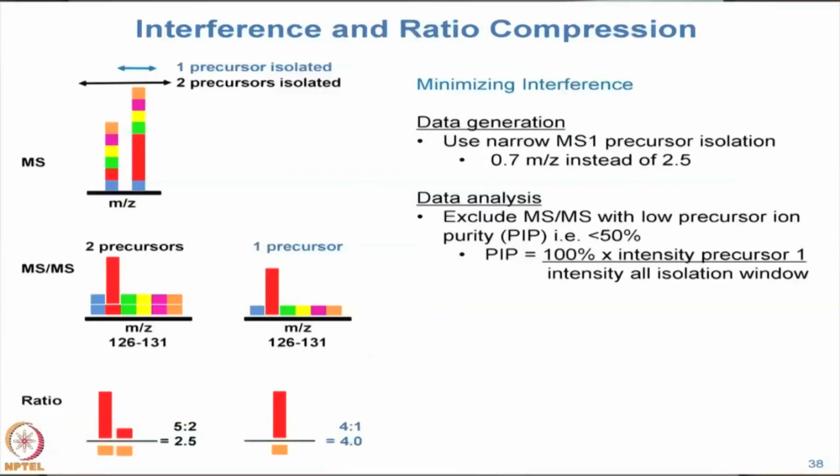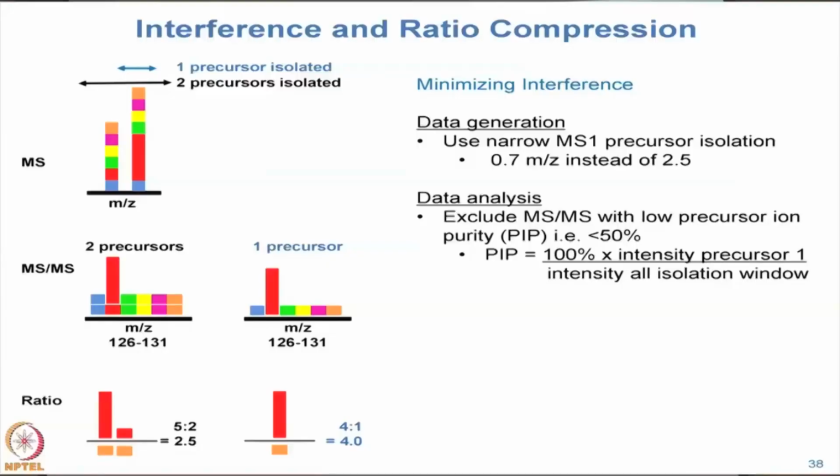All right, there's another part of complication in working with TMT quantitation, and that comes down to interference, which goes back to if you fragment more than one thing at a time. I've tried to draw a cartoon here to illustrate how this works. If you had two peptides of very similar precursor mass that were present at the same time, and let's say one of them is uninteresting, there's no one of the 6 samples that has either up or down regulated levels of protein. But in the sample that's right next to it, it has up-regulated levels of the red. So there's way more red in this one than there is in the other one.